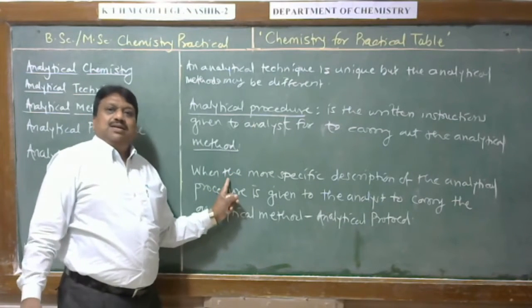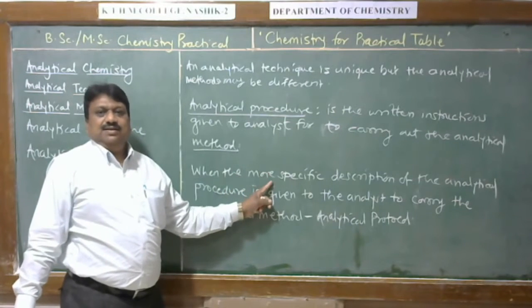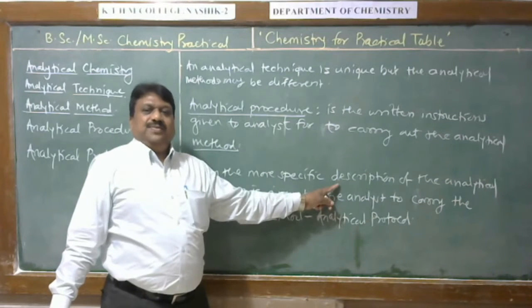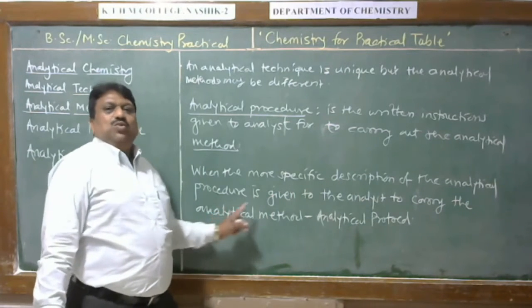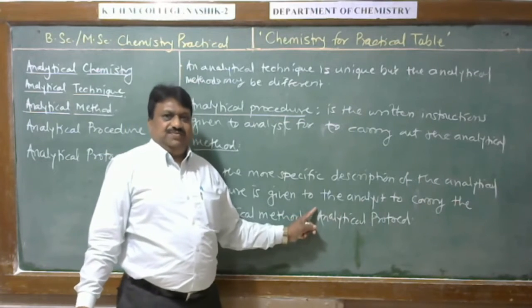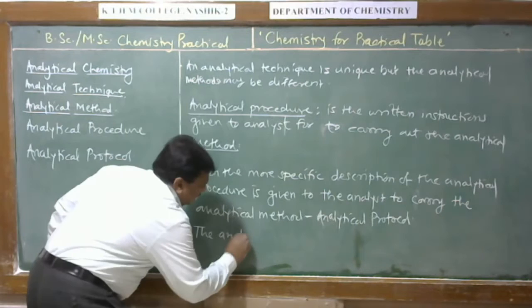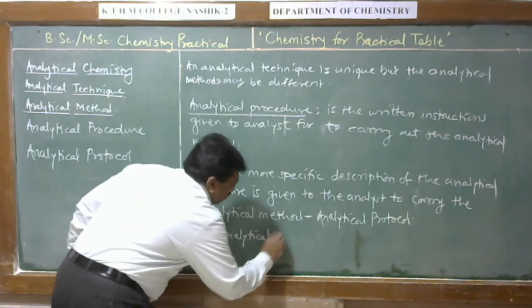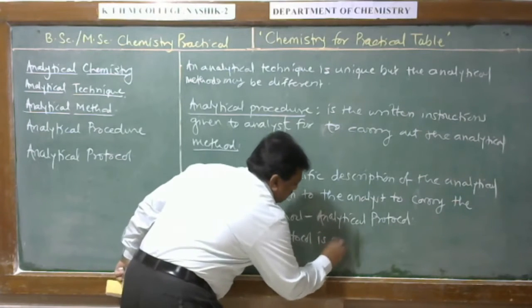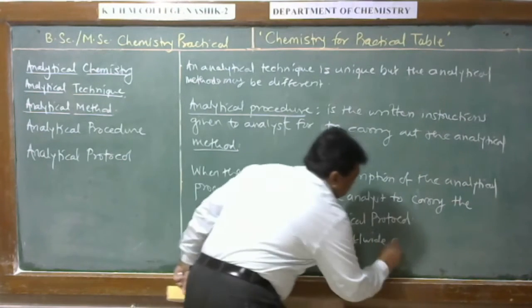But when the description is like this: heat the sample at 90 degree, dissolve the sample in distilled water, then titrate it with 0.1 normal solution. These are the specific instructions. Then it is an analytical protocol. The analytical protocol is worldwide approved.